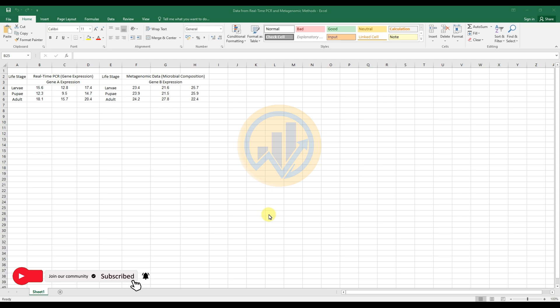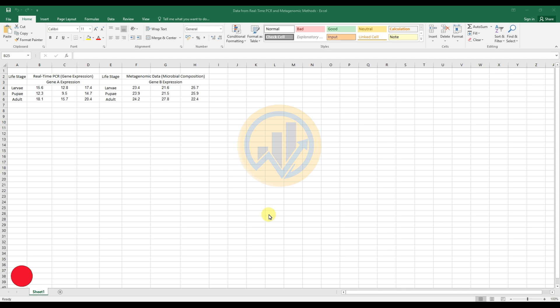Now our discussion topic is how to create a combined bar and line chart in GraphPad Prism software. We will look at the dataset used to create this combined bar and line chart in GraphPad Prism software.